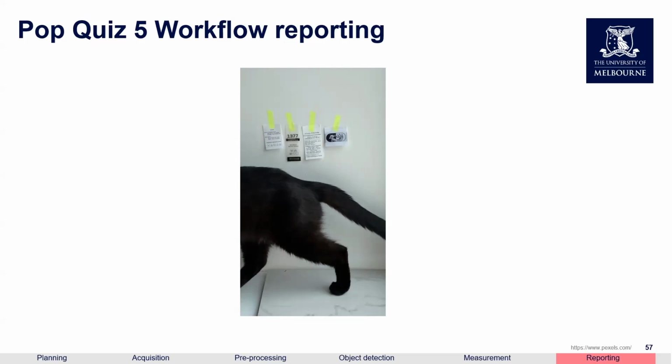If it's a completely new workflow, then it's always good to have an example dataset so that people can actually try it and understand what can happen. None of the image analysis workflows will be perfect, so it's always good to mention the limitations as well as the rationale used. I guess everyone would appreciate it if someone published their workflow this way, because then you can actually replicate the work properly.